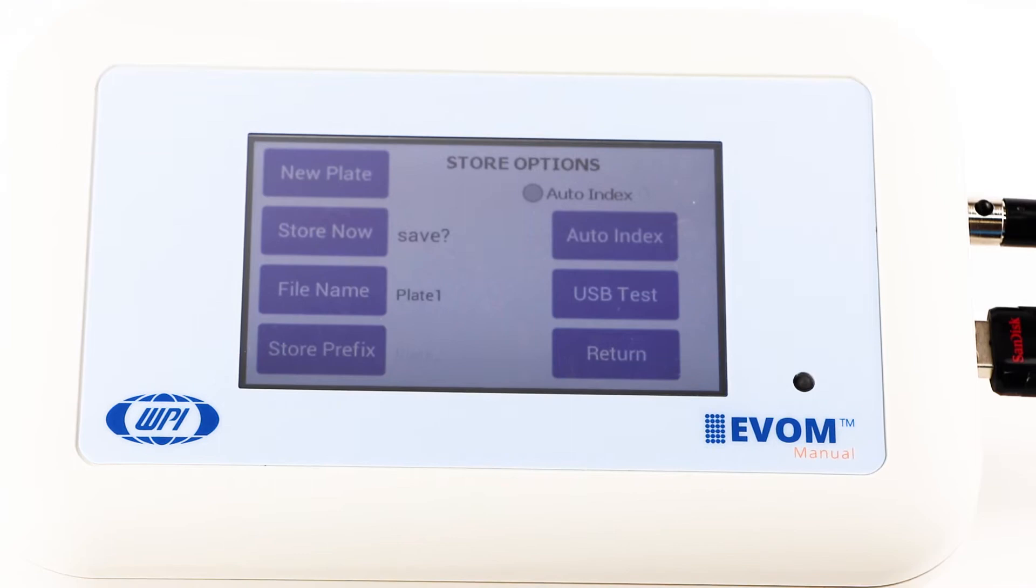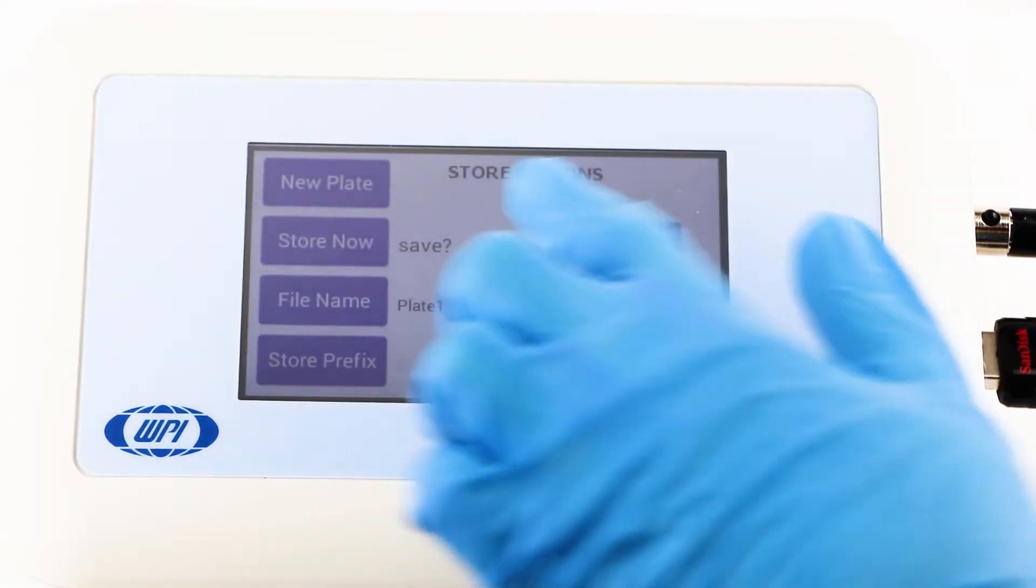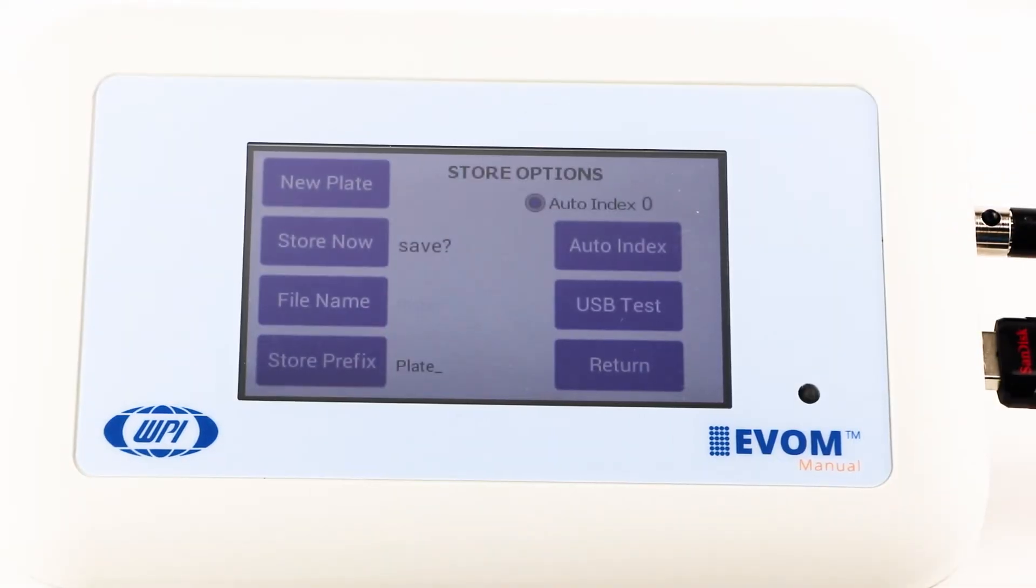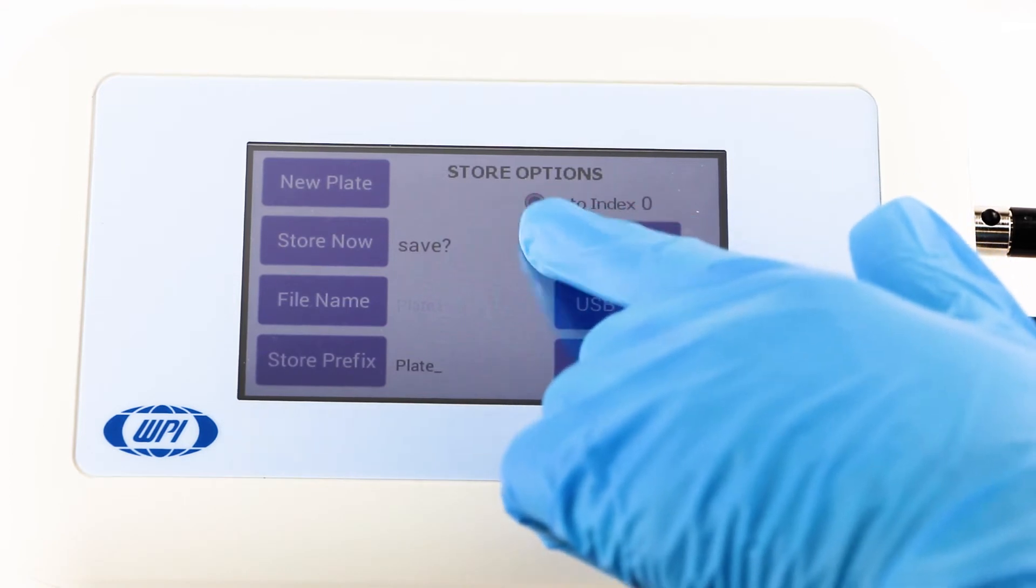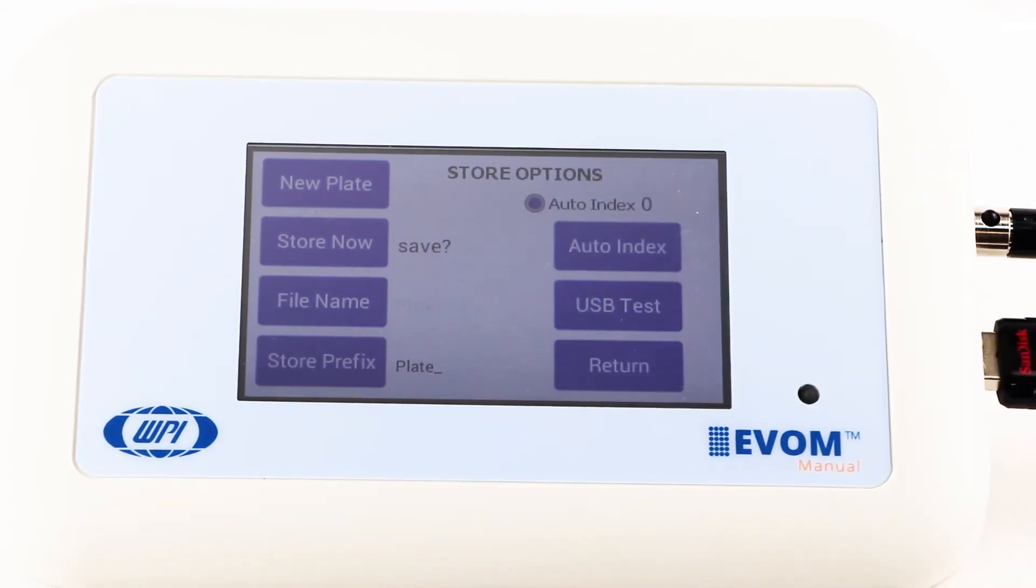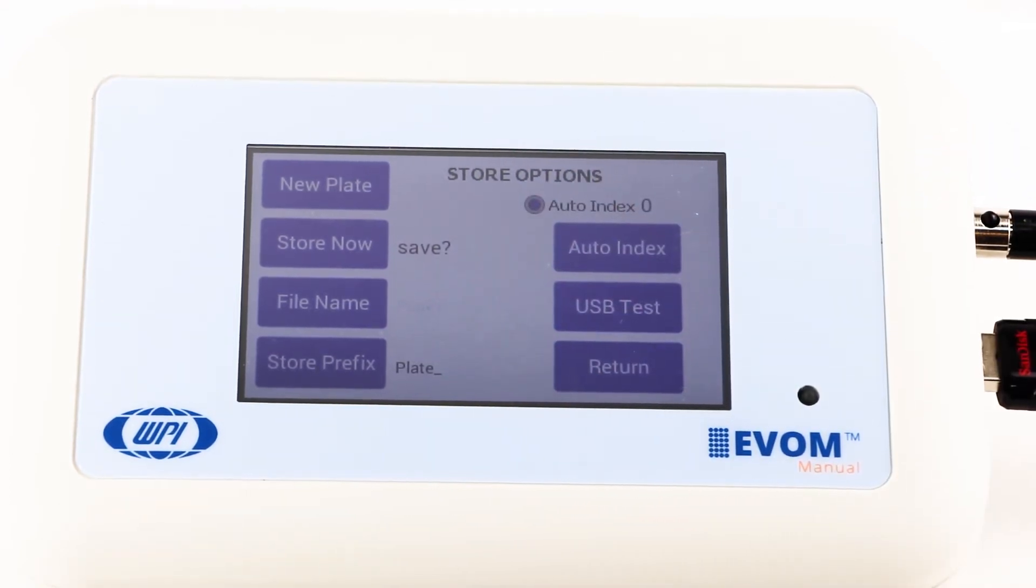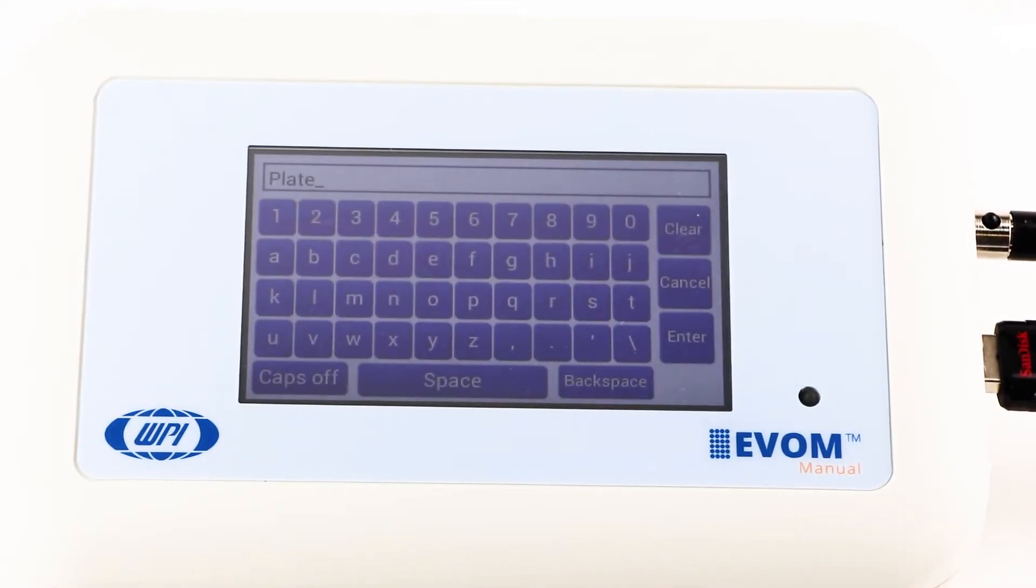To use a prefix and auto-indexing, activate the auto-index radio button. Auto-indexing sets the name to a numeric sequence with a prefix and a sequential number. Then you can press the store prefix to enter the prefix.